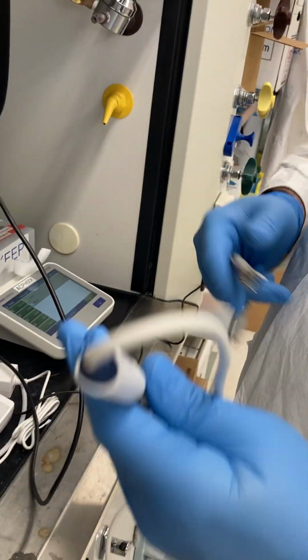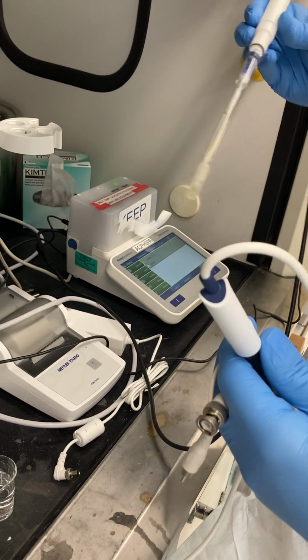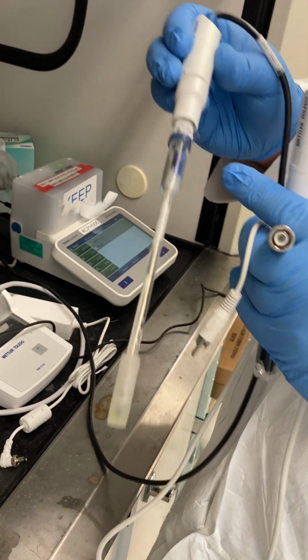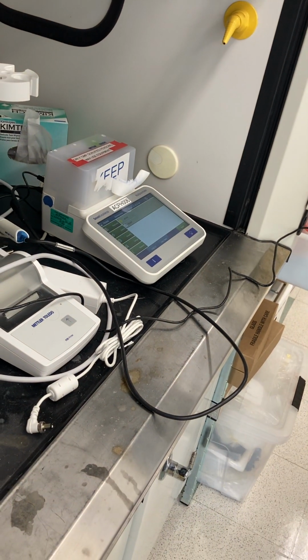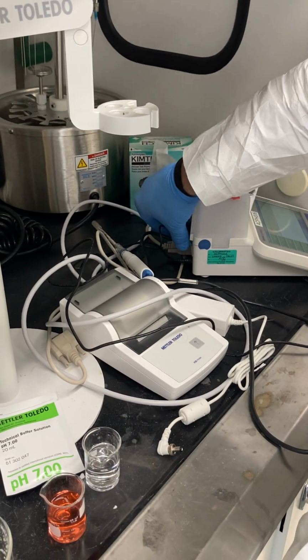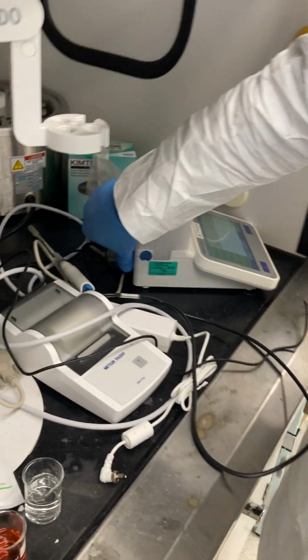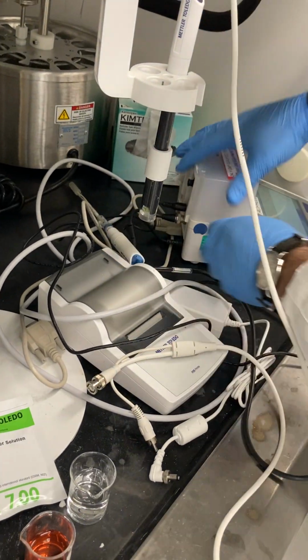Obviously, a different style probe. This one is a plastic housing. Right, cool. And actually, these probes are meant to be serviceable, right? The fact that there's a hole in here, you're supposed to be able to open that up and refill the reference electrolyte. I told Jack earlier, we could attempt to clean it, but I'd be more concerned that if I tried to clean it, I'd break it more than anything. So we will just not be doing that.